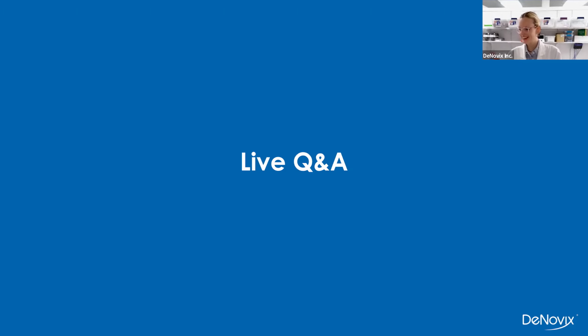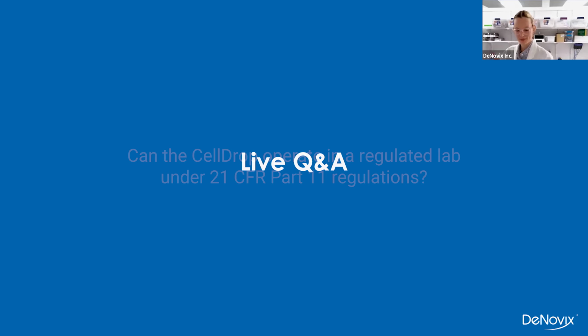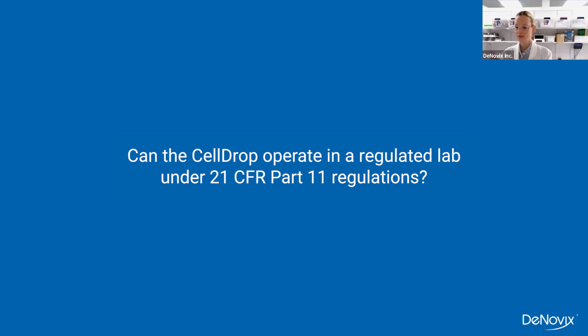Okay, the first one was somebody asking about whether the CellDrop can operate in a kind of regulated lab under 21 CFR Part 11 regulation. Yes, we're 21 CFR compliant and GMP compliant, and so we have IQ/OQ packages as well that can be purchased.